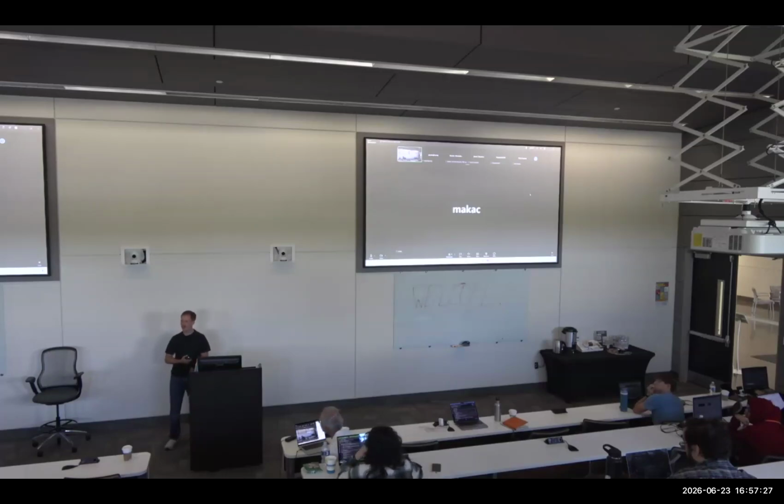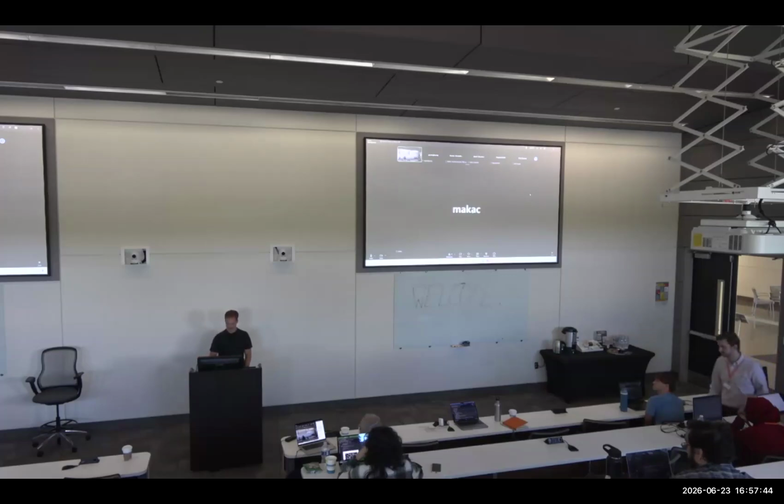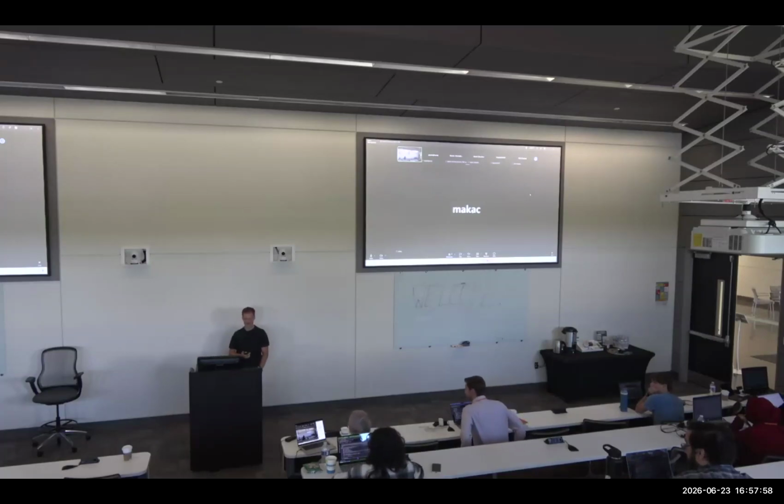Did anyone see a pattern on the edge of the particles? About 5 pixels from the edge, the particles become amorphous. So the radial sum would just go right downhill and probably cause some problems. So those were all of the patterns. Did anybody get an adaptive map, where you just take a few measurements and then you get the map going with the reconstruction? No? Okay. Keep working on it then. Yeah. It was a lot to do in an hour.